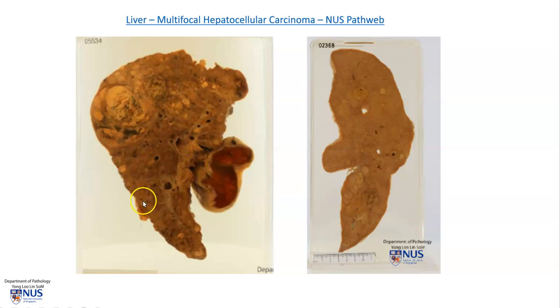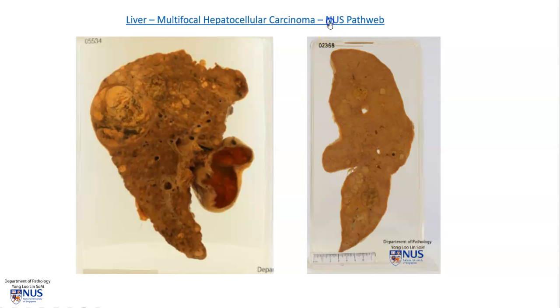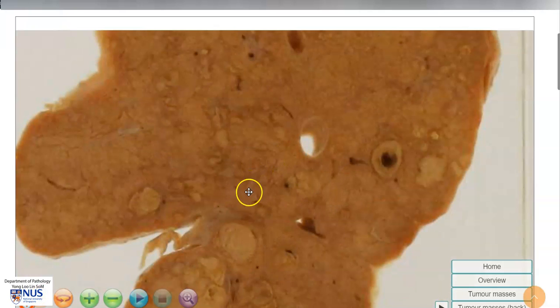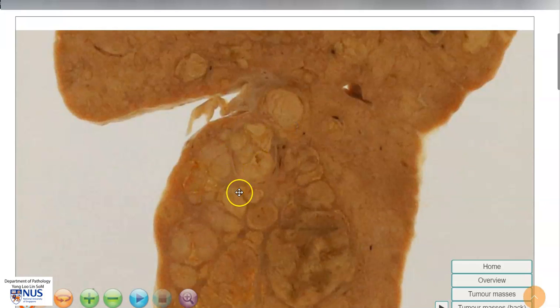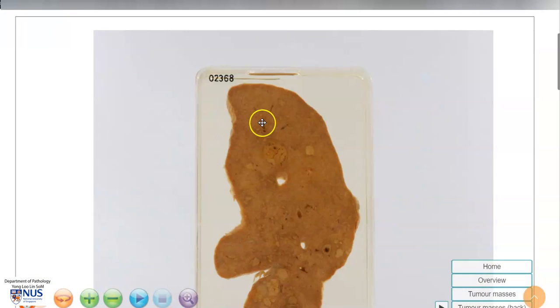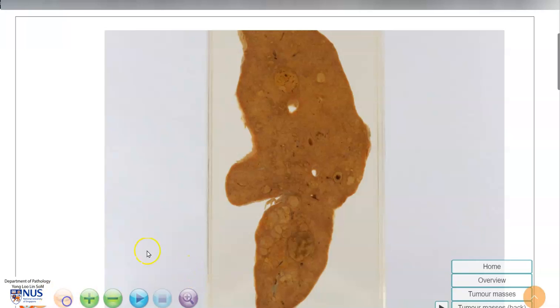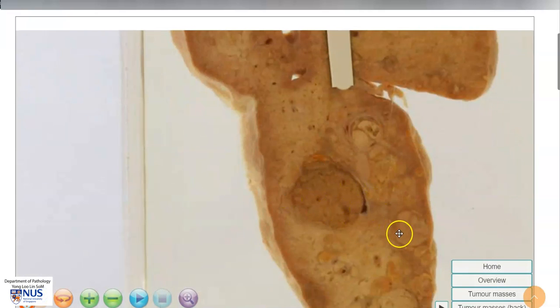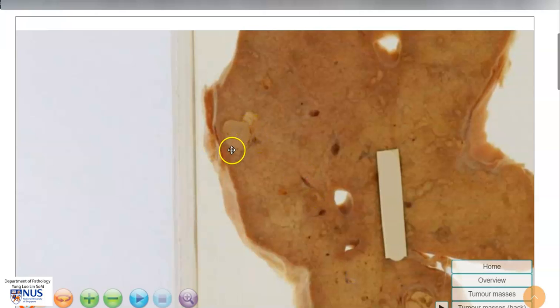Here is the gallbladder, this is the cirrhotic liver, and here we can see multiple tumor nodules. Here is another example where, quite subtly, we can see multiple tumor nodules. Having a closer look, we can see these pale nodules — which can be quite subtle grossly — but these are foci of hepatocellular carcinoma, here, here, and here again. You can see that this tumor is indeed multifocal with multiple tumor nodules, and similarly on the opposite side we can recognize multiple fleshy tumor nodules.